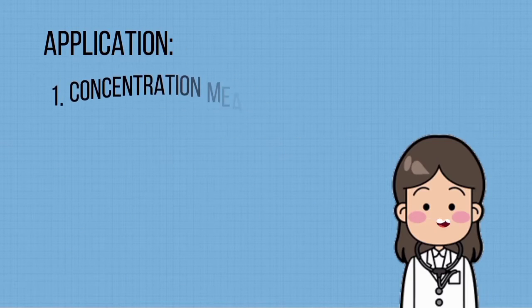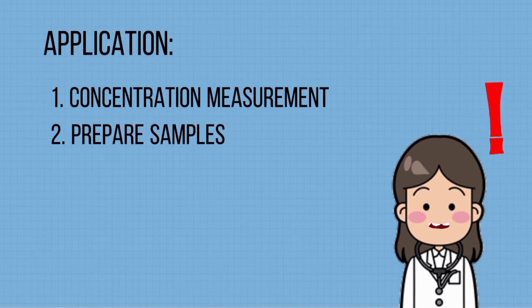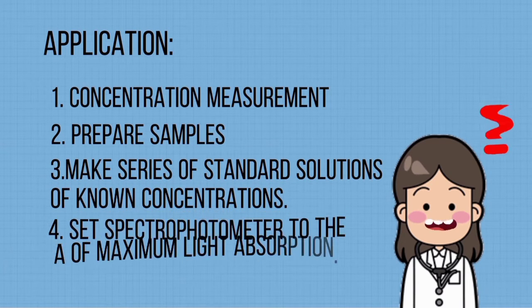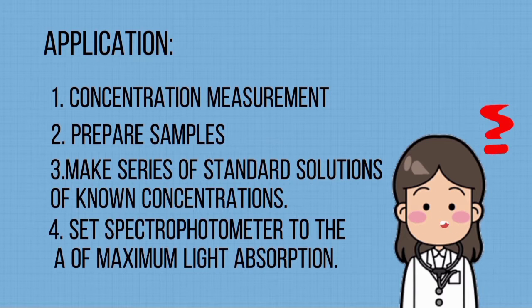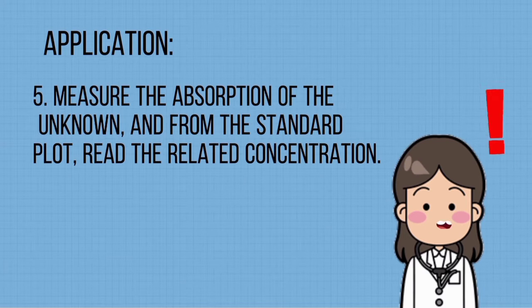Application. 1. Concentration measurement. 2. Prepare samples. 3. Make a series of standard solutions of known concentrations. 4. Set the spectrophotometer to the maximum light absorption. 5. Measure the absorption of the unknown and, from the standard plot, read the related concentration.